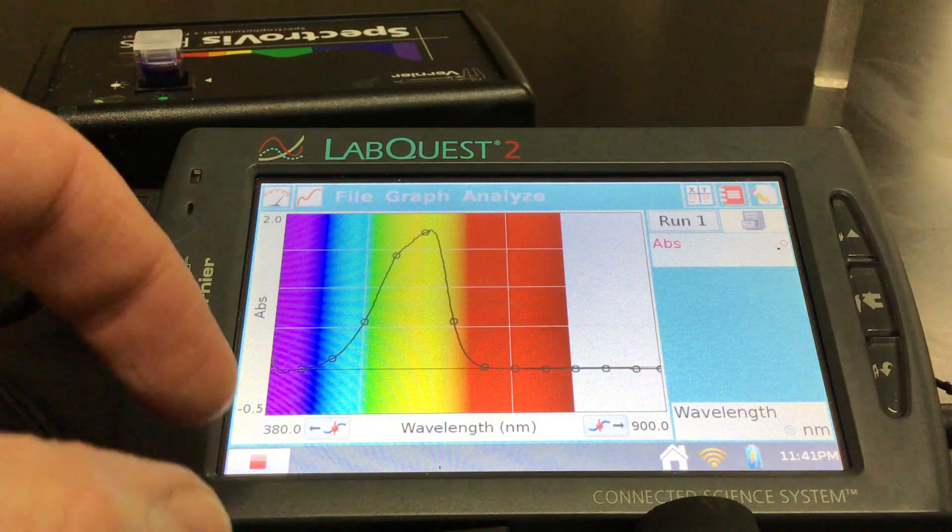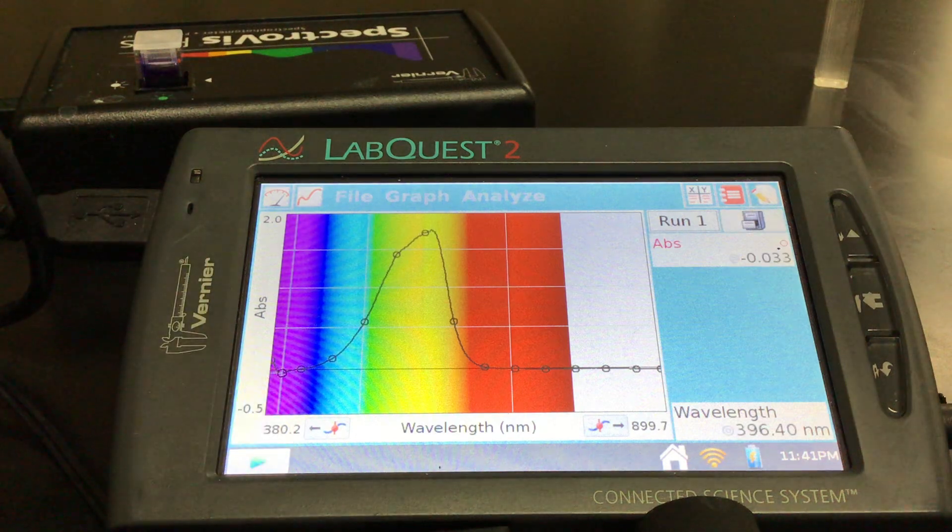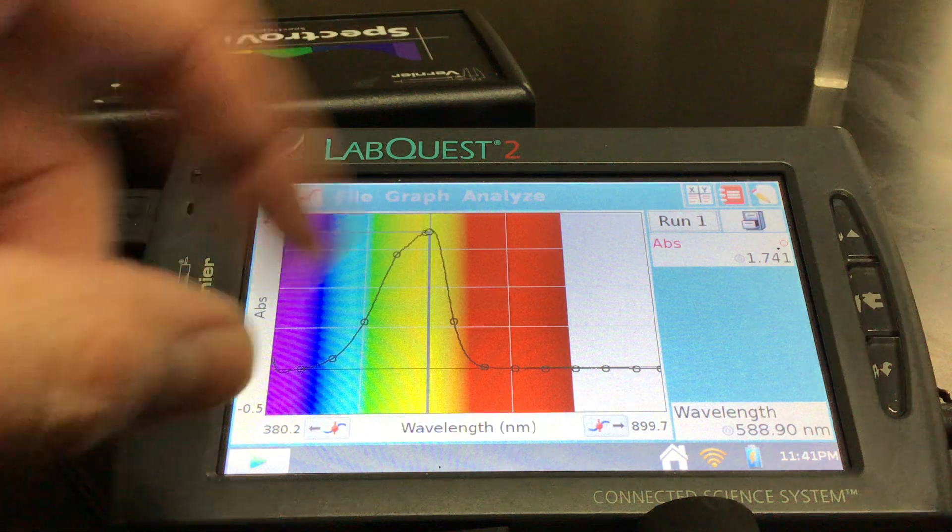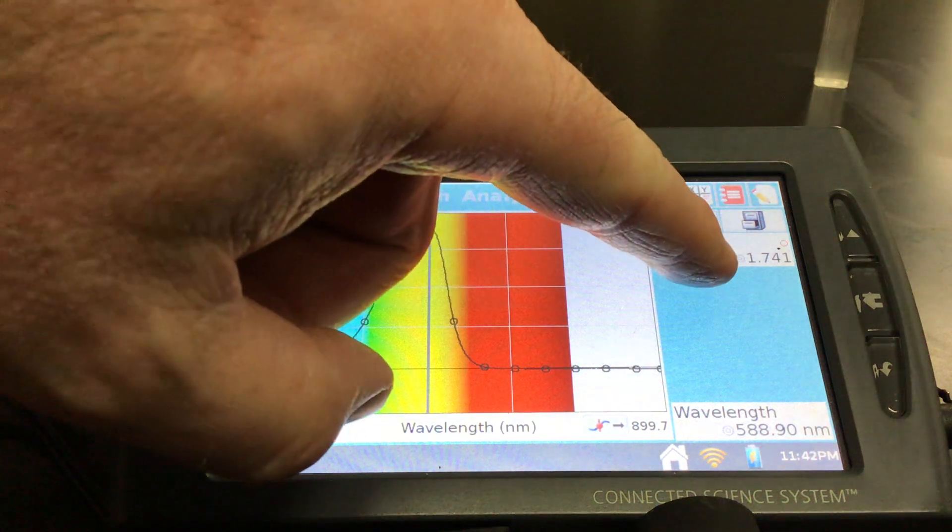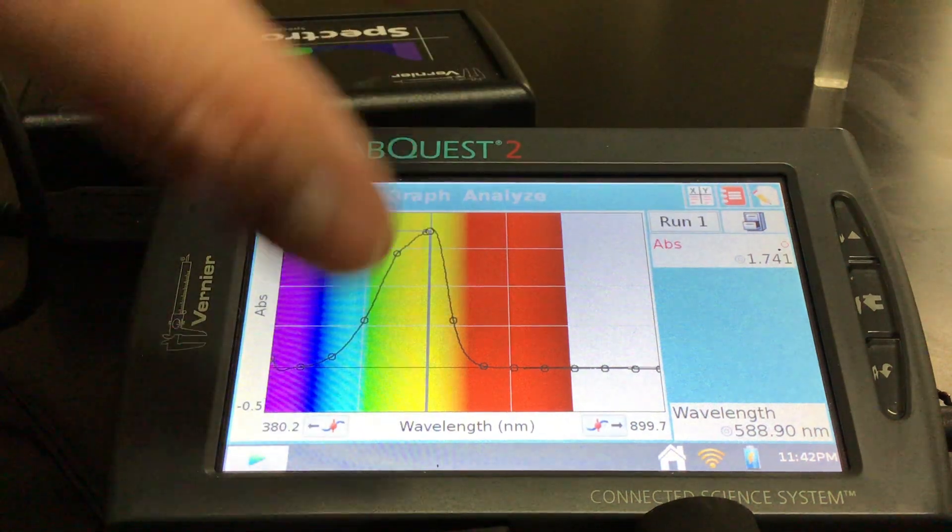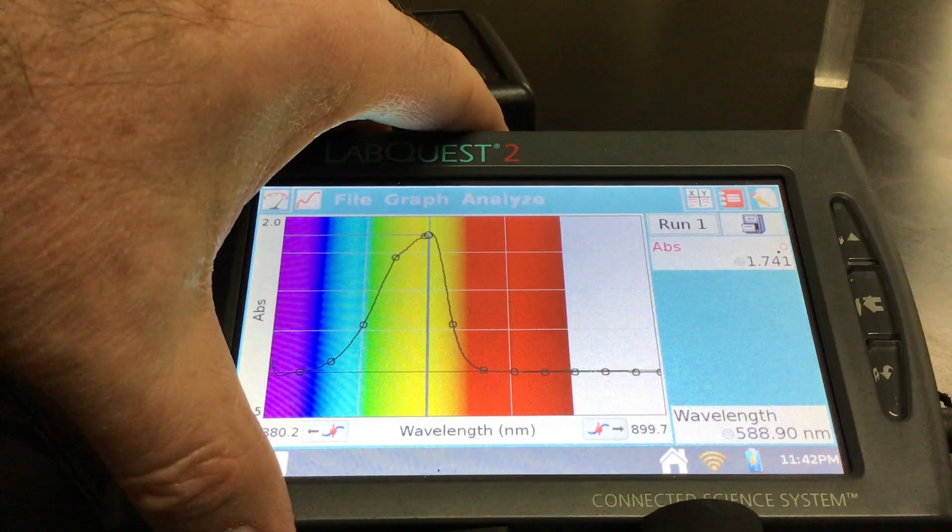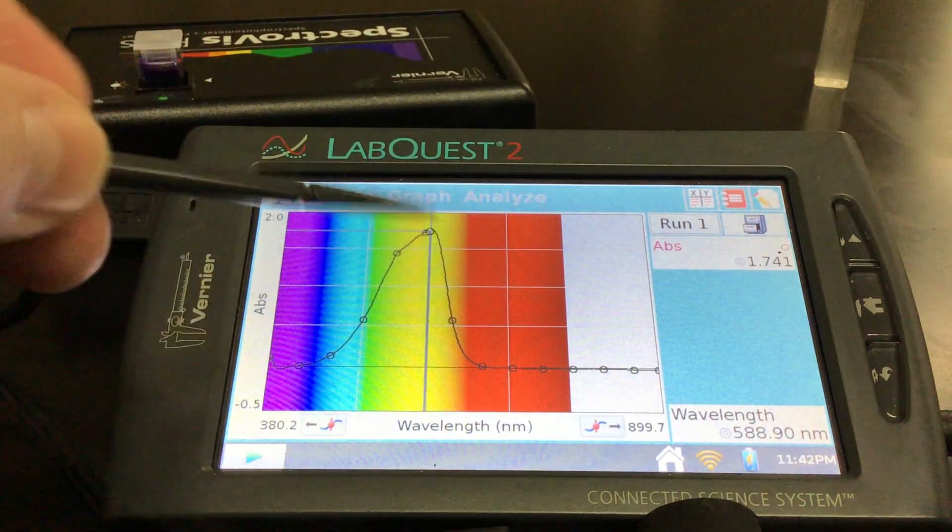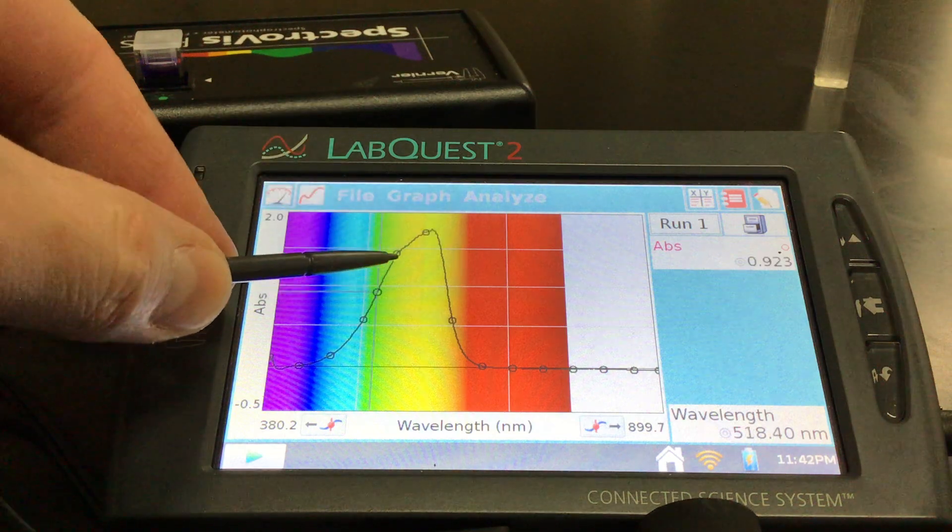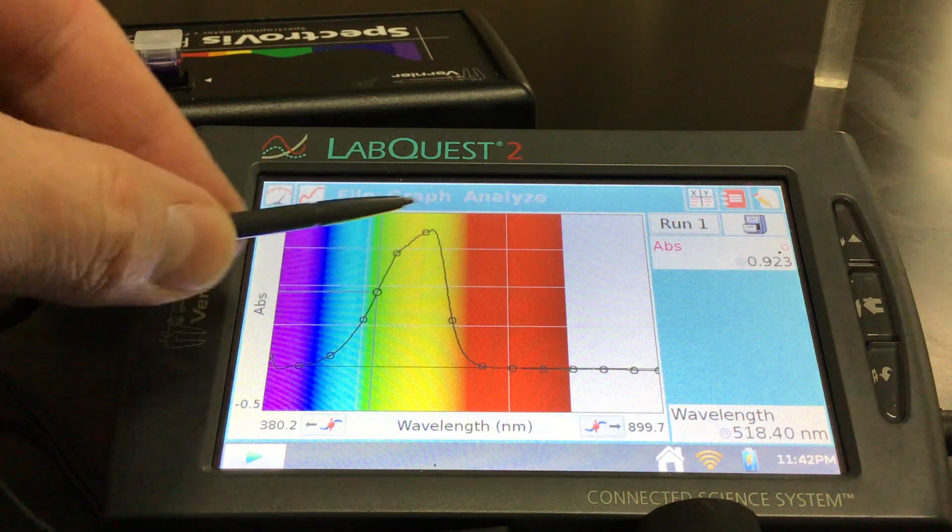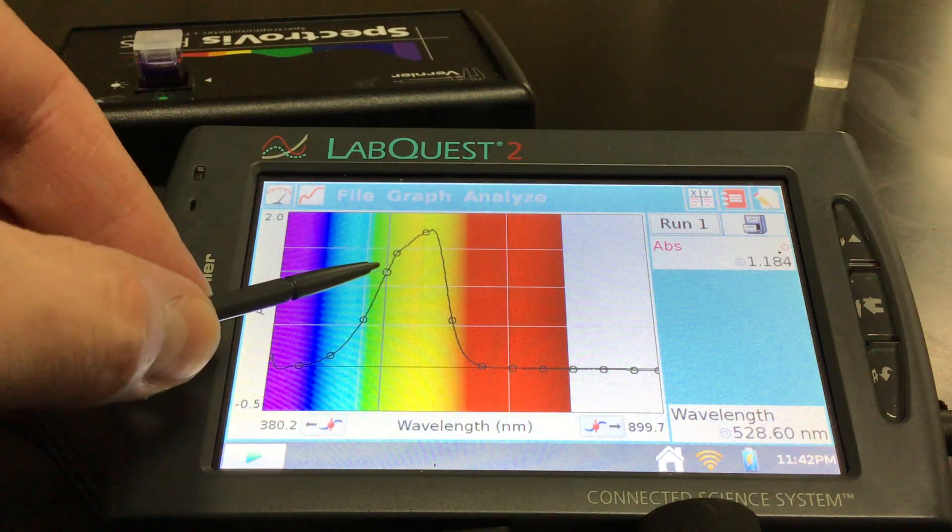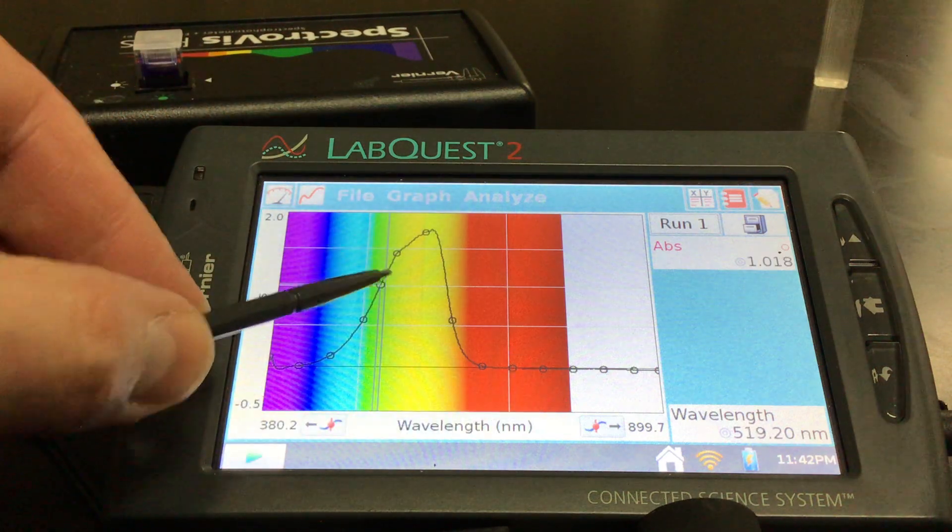We have a nice peak here, however, let's go ahead and press stop. If I were to choose the peak towards the top there, the absorbance is over one, so that wouldn't be good for us because absorbance and concentration are not proportional above one. We're going to pick something on the shoulder here somewhere between maybe 0.9 and 1, as long as we're definitely below one.